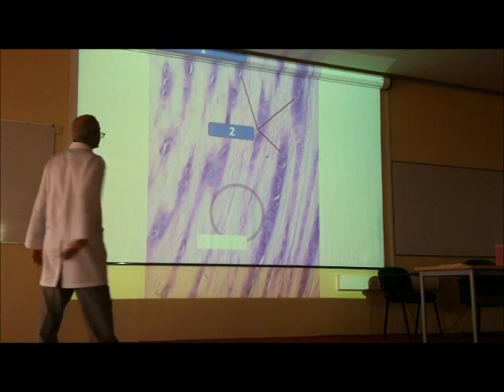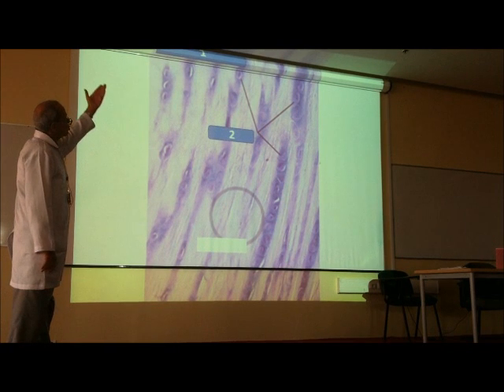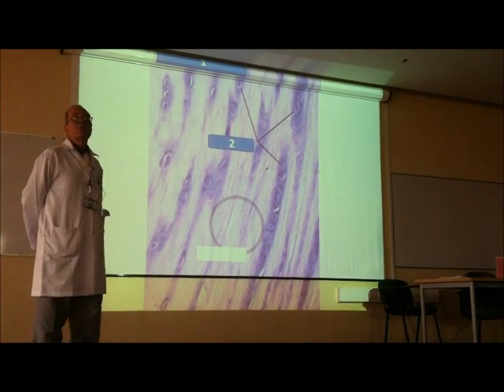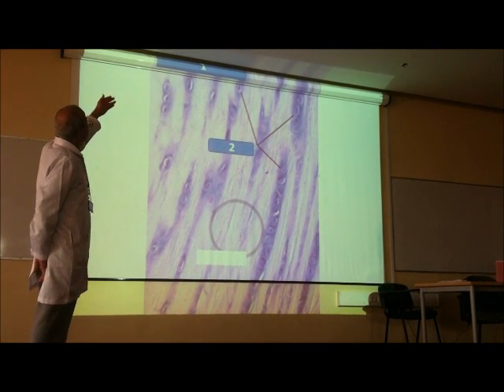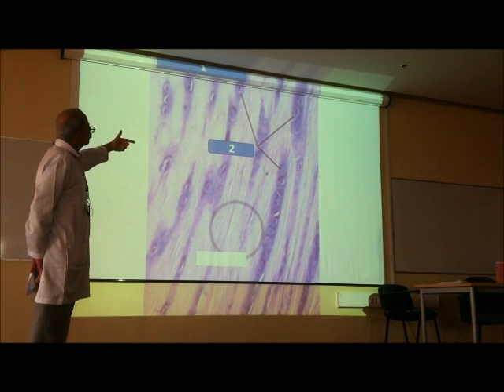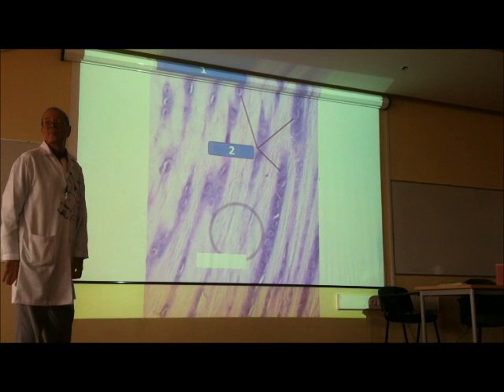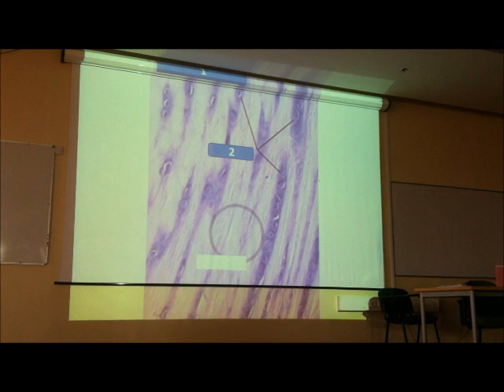What is this type of section? Fibrocartilage. What does the upper arrow, number 2, indicate? Rows of what? Chondrocytes inside lacunae. What is the name of this cartilage, number 1? It is white fibrocartilage. Number 2, chondrocytes in rows, or rows of chondrocytes. Yes. White fibrocartilage.